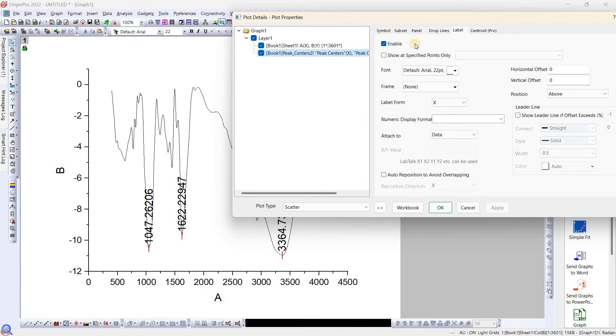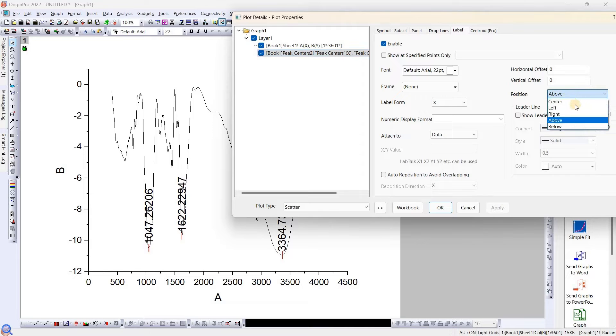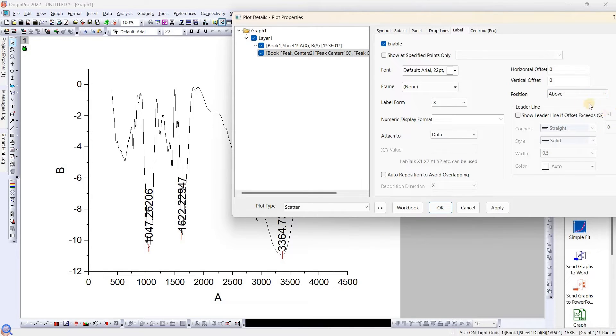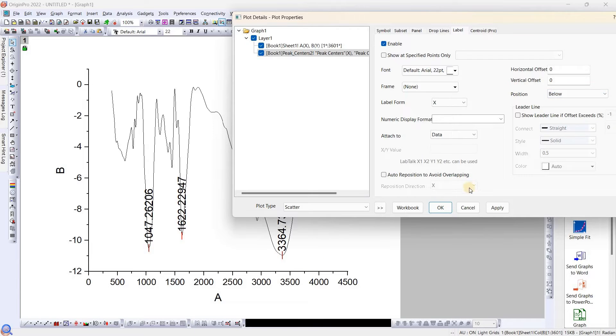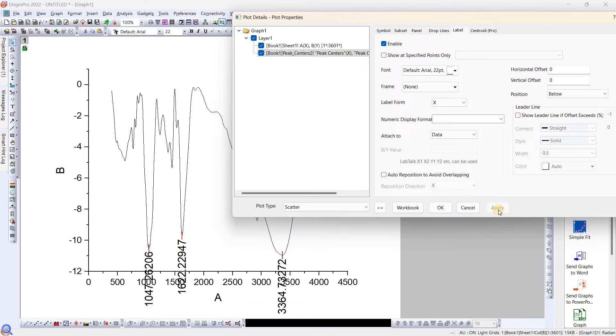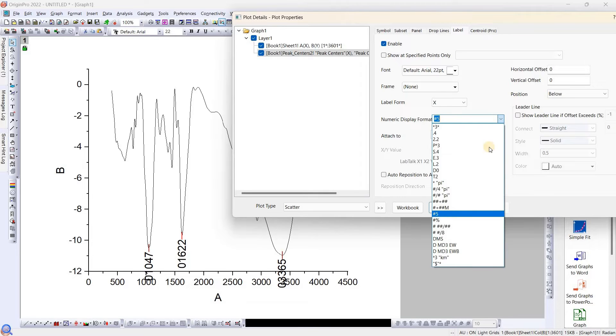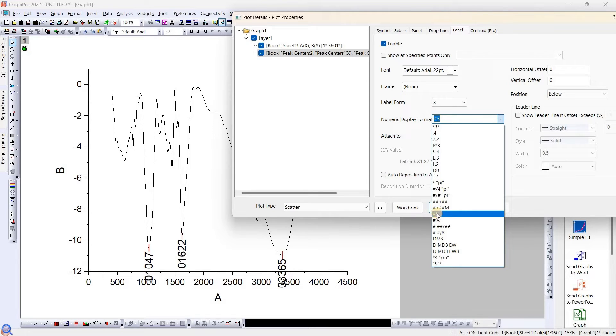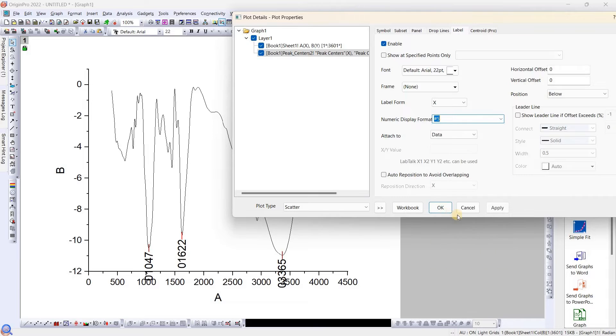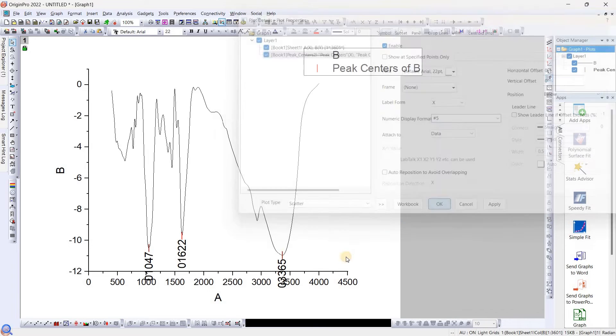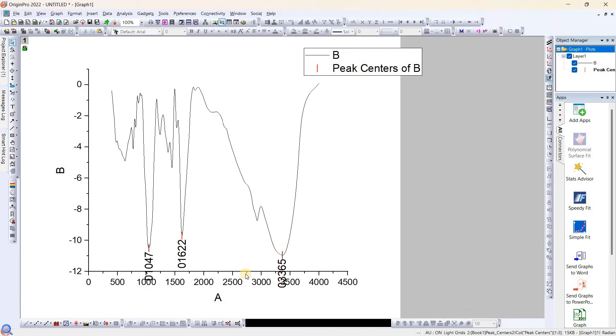Again, we need to do editing of this. We can position below the drop line and we need to rotate that one also. I have selected the numerical display format as hashtag five, that should show the numerical value.